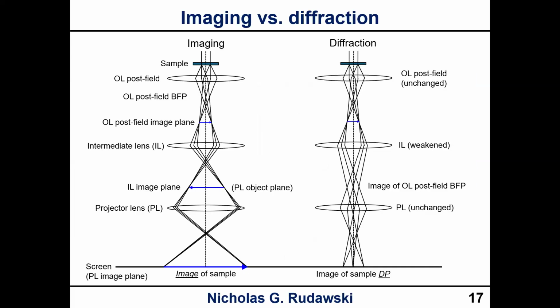This is important because we have to understand the role of the microscope and how we are able to go between what we call image mode and diffraction mode, which is very powerful: literally, with the push of a button, I can see an image, and then if I want, see a diffraction pattern. This is one of the really powerful aspects of STEM.